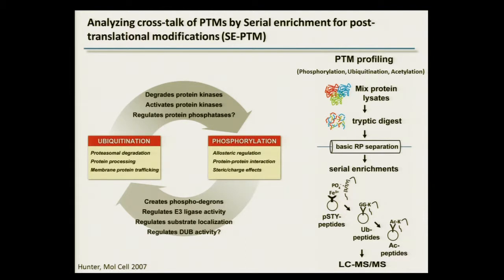Therefore, we really think it's a really good strategy to save sample amount because you can do those enrichment techniques from the same sample, and you don't have to do those experiments in parallel, how it's usually done in other papers.